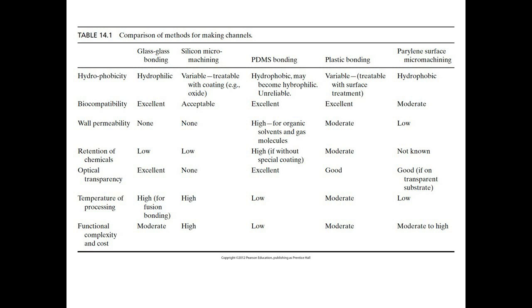And sometimes you need to consider the wall permeability. Some are good, for instance wall permeability none, but PDMS has high wall permeability, and plastic also has moderate permeability. Biocompatibility, we can say all of them are acceptable, except maybe parylene you have to consider.